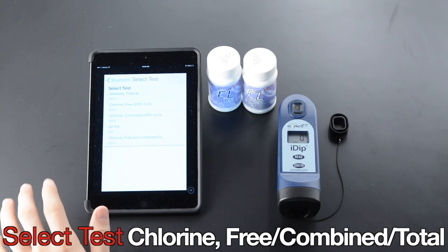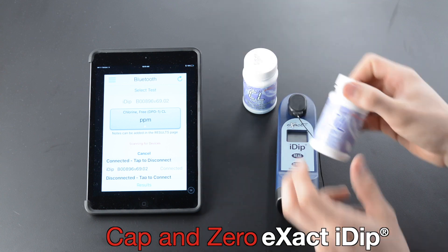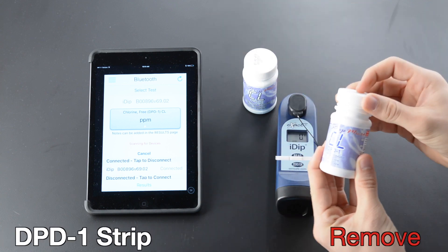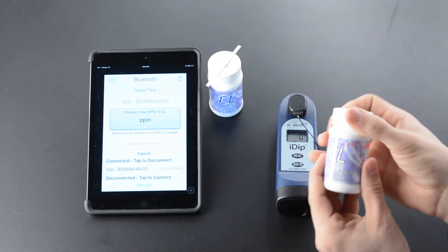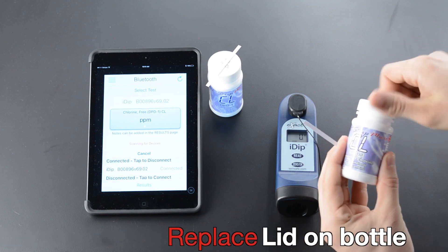Select Test. Cap and zero XactiDip. Remove strip. Replace lid on bottle. Remove strip. Replace lid on bottle.